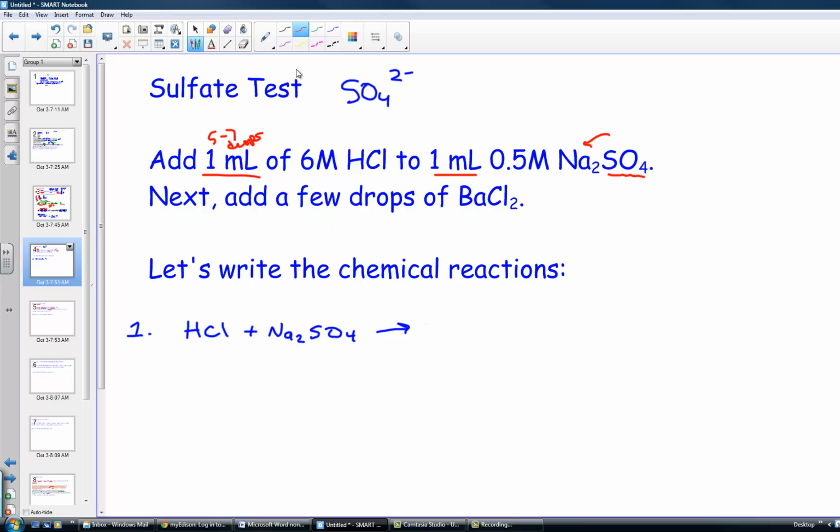Alrighty, so what do we have so far down here? Into a small test tube, I take a squirt of HCl and add it to a squirt of sodium sulfate. Pattern of change, H goes to SO4, and based on charge, I still like to help students learn we're always connecting by charge. So sometimes if I just take a moment and write those up there, it helps me when I crisscross and predict products over here.